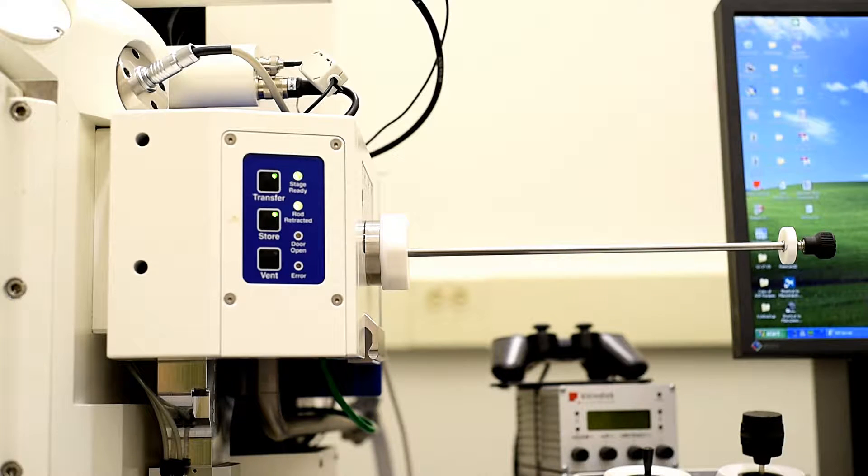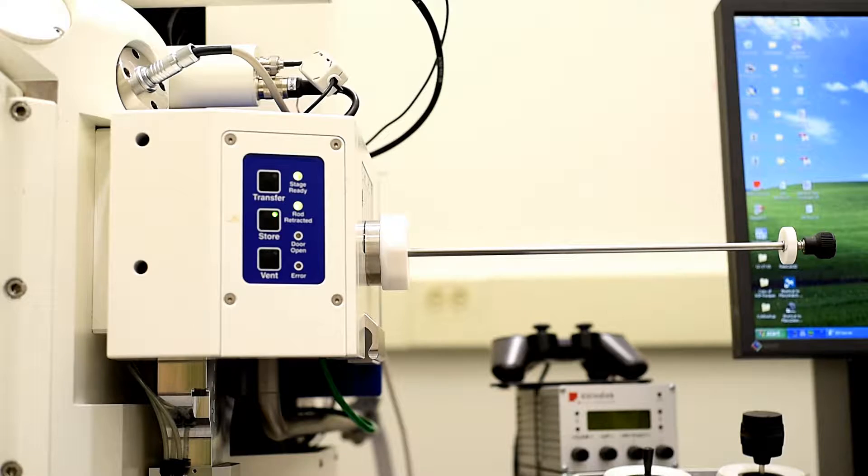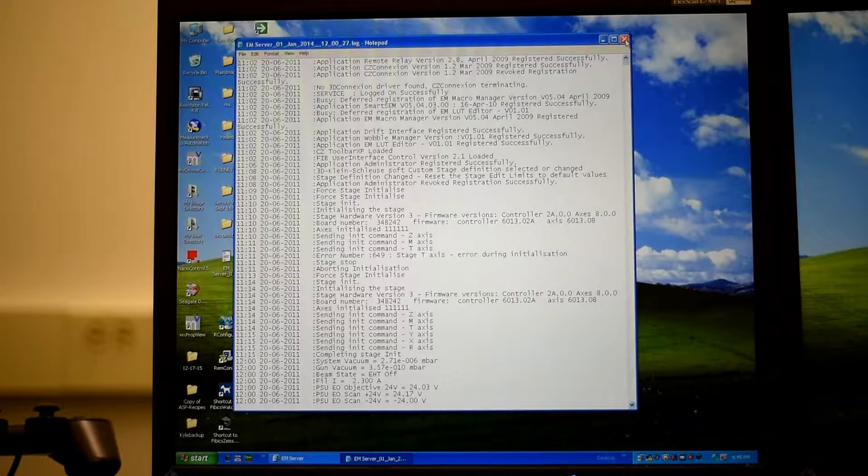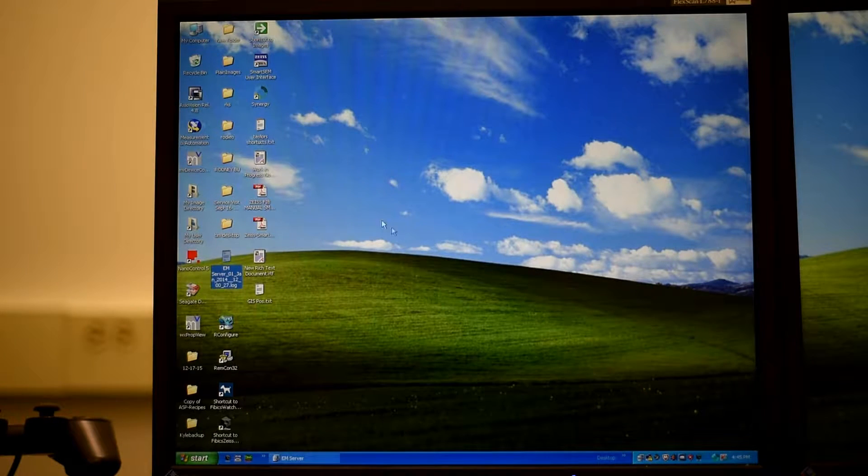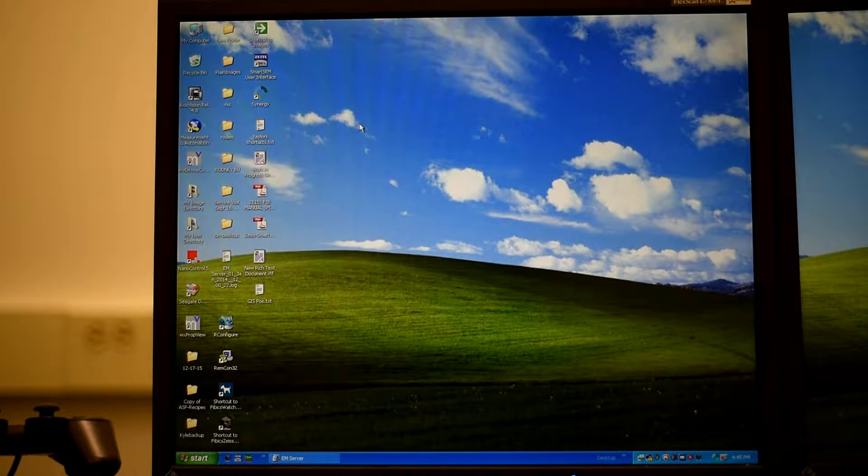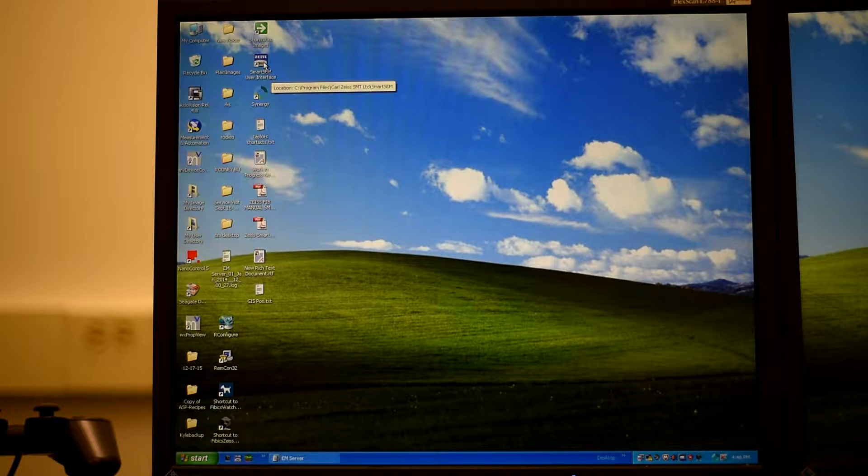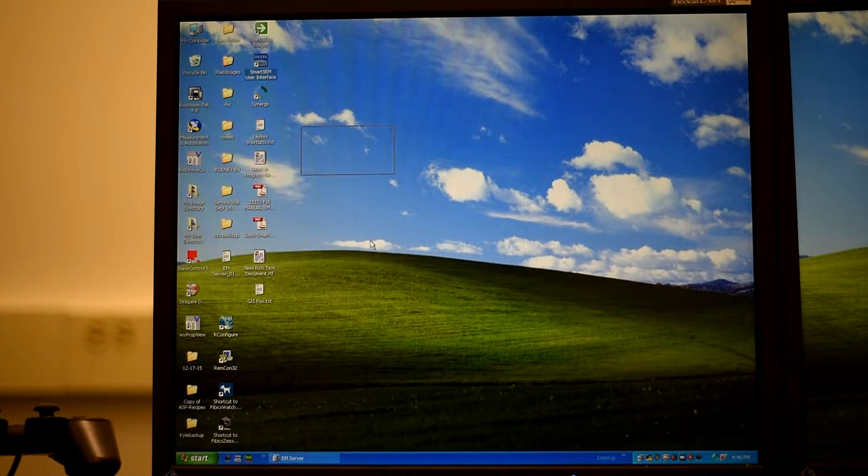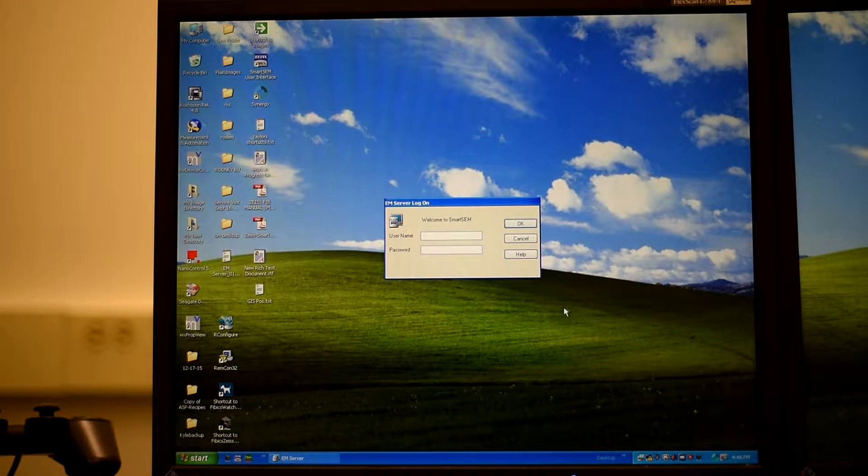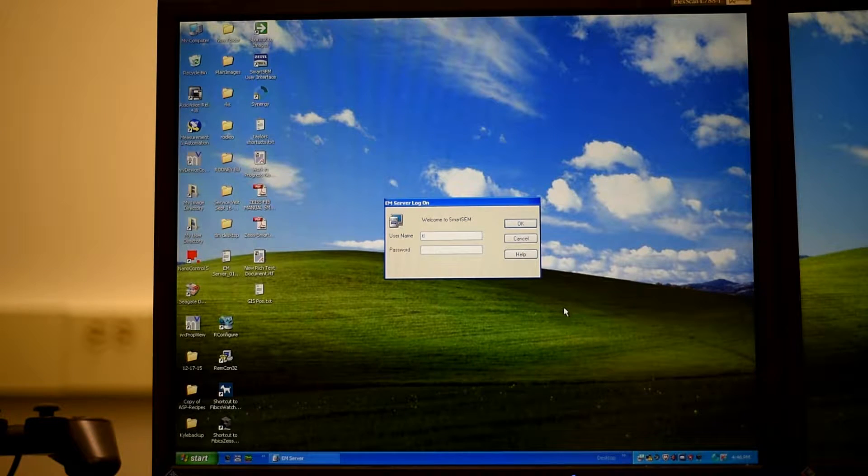So at this point we have our samples inside of the SEM and now we'll move to the computer part. So to start the program it's Smart SEM, so if you double click that, it will bring you to a prompt to log in.